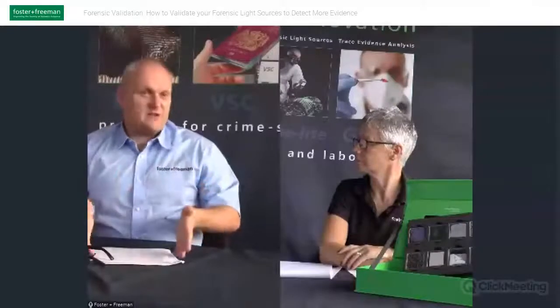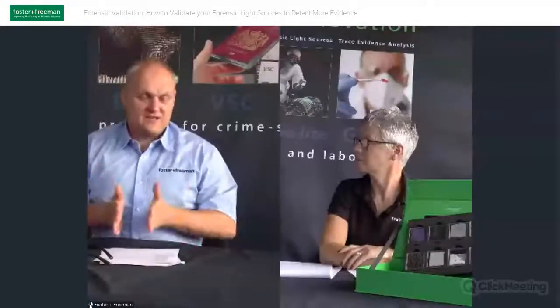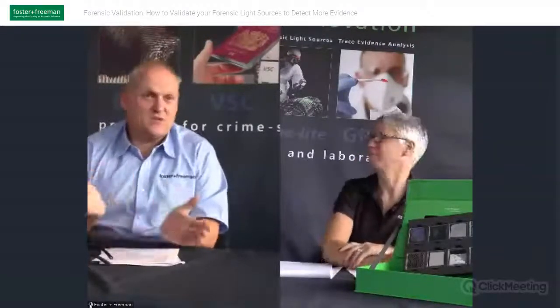And until you test it, you don't know. It's unfortunate because everyone wants a simple answer: oh, the best light source is blue, use that. Now we can generalize for the different body fluids, but the best light source for your sample, only you can decide by using the different light sources and seeing which one gives you the most contrast.